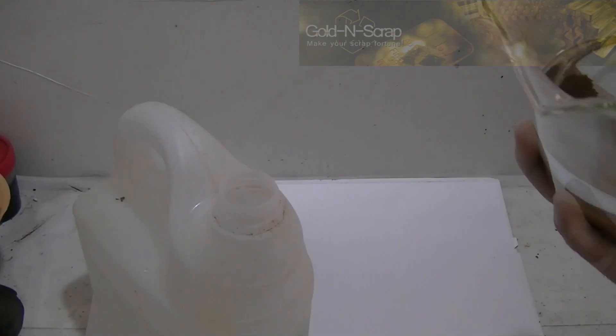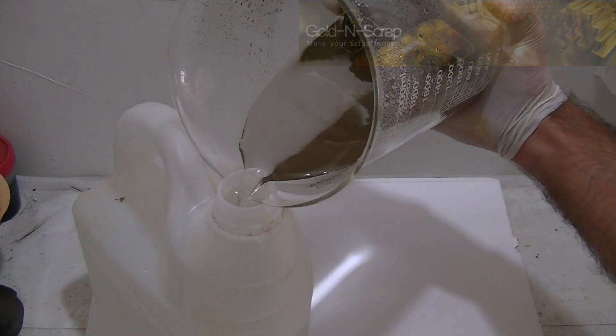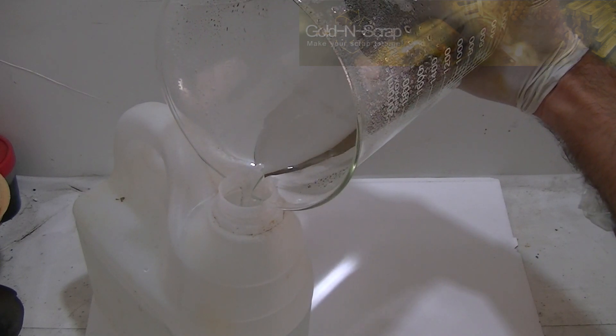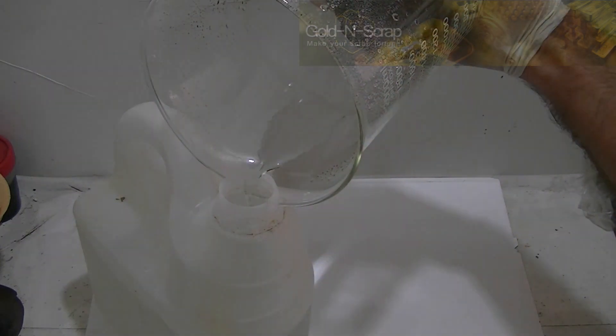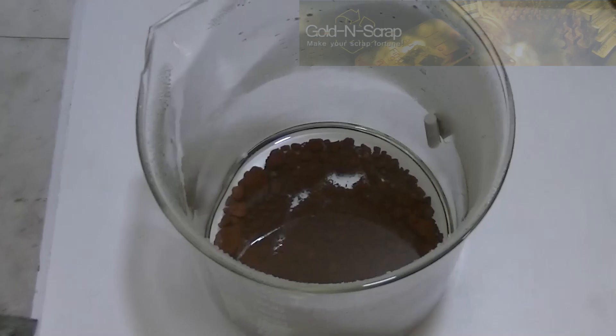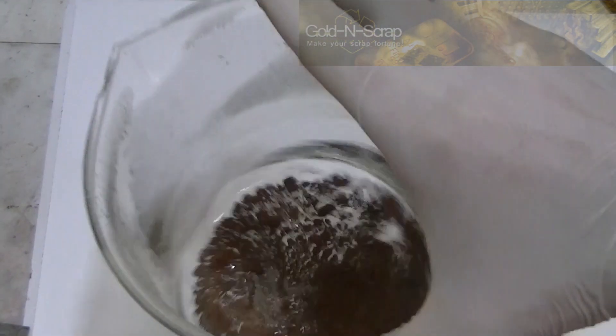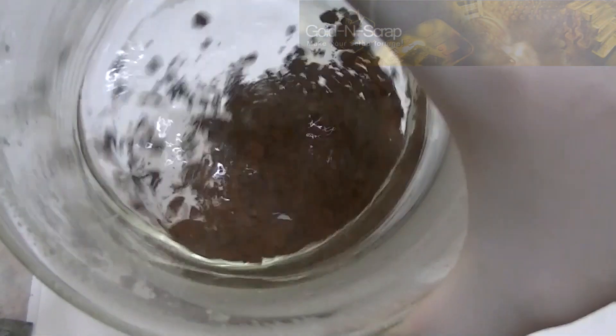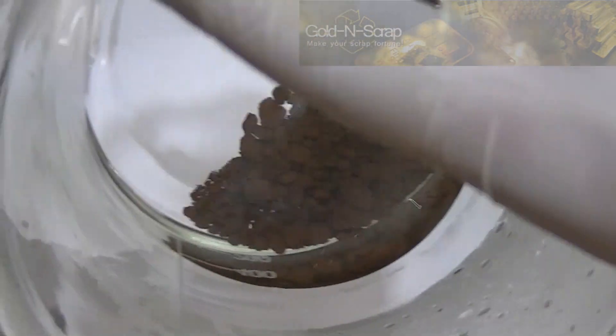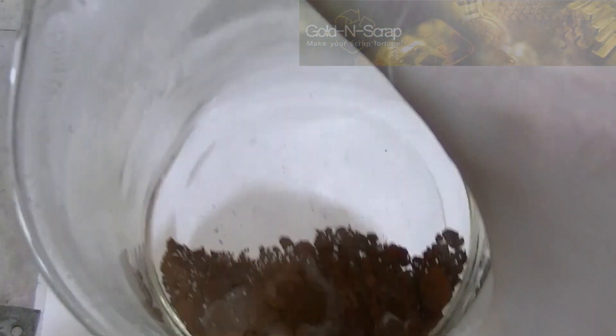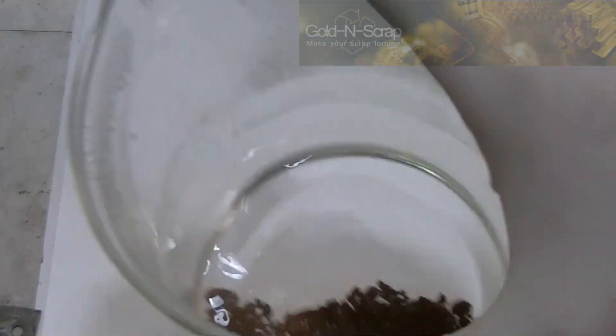The bulk of the solution is slowly decanted and the washing cycles begin. The washing cycles are extremely important if commercially pure gold is wanted. Starting with a simple tap water wash. The gold powder is covered with boiling hot water, swirled for a while and left to cool back down. This water wash is repeated two more times.